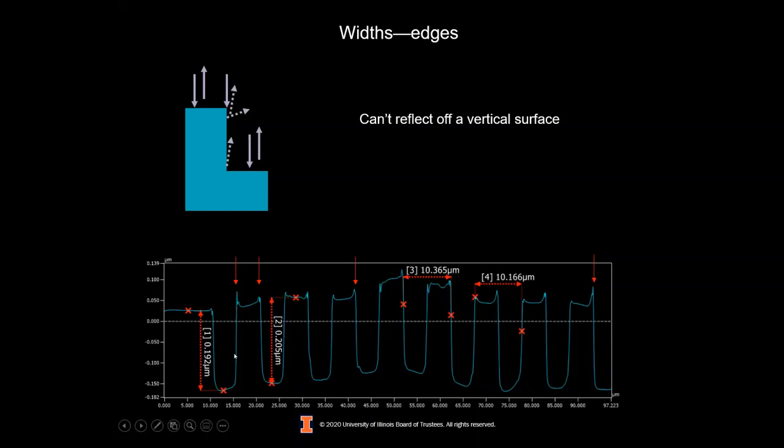And you may see this beautiful straight line, but that doesn't mean you're actually measuring it, because generally the software for whatever 3D optical profiler you're using will automatically interpolate and connect the dots between the few data points that it has. So if you're measuring the roughness or numerical parameters on a sample like this, you should mask out those artifacts.